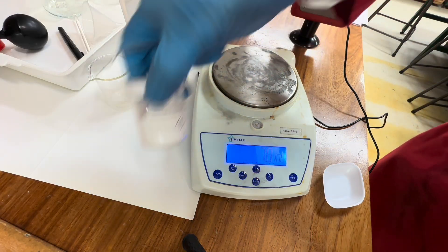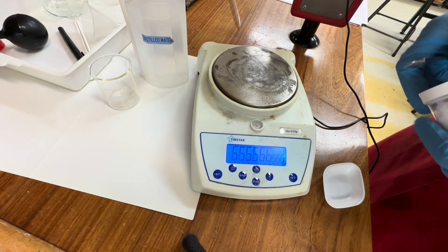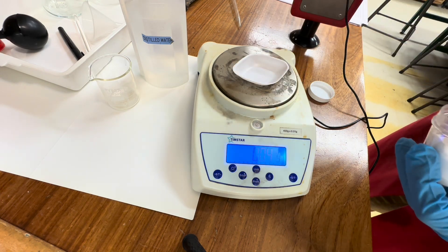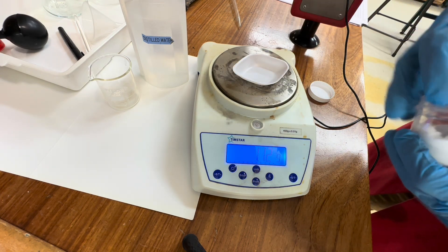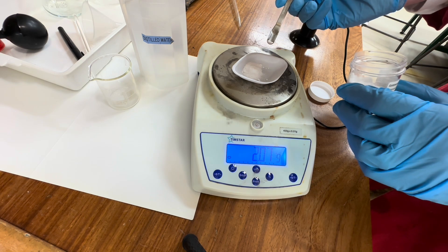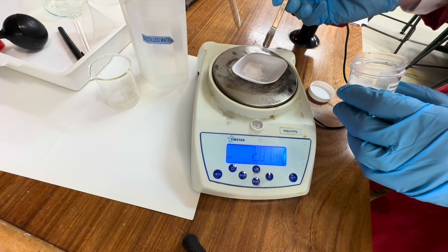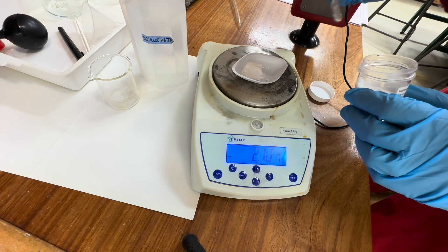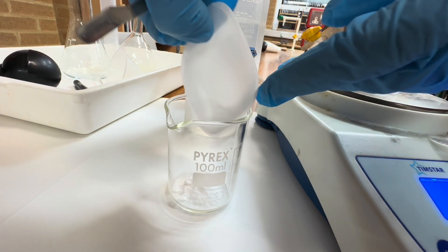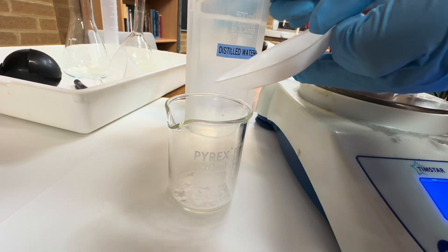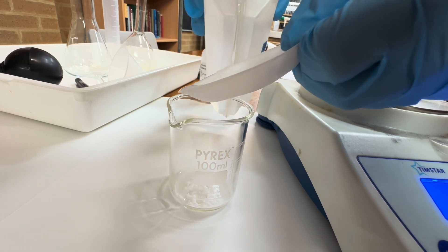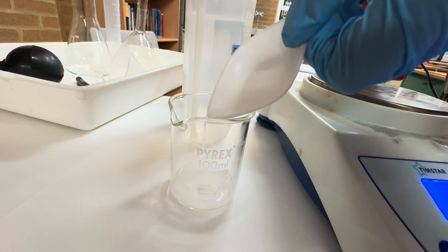We can measure 2.1 grams of sodium hydrocarbonate and now we must place this in a clean dry beaker. We must ensure that all of the sodium hydrocarbonate has gone into the beaker, so we'll rinse it with some distilled water to make sure that we do not lose any.